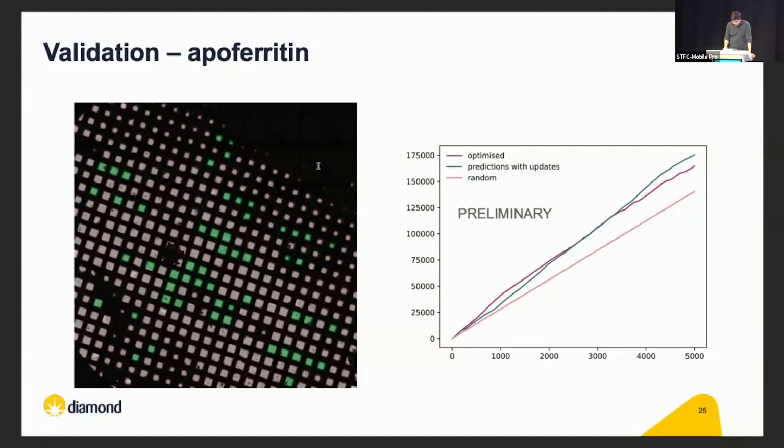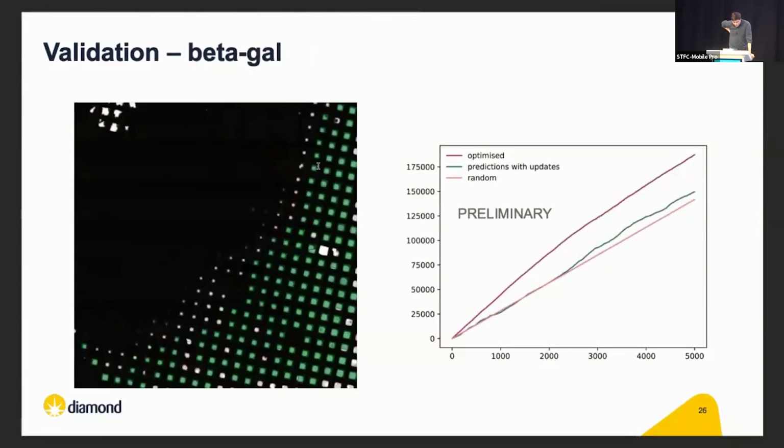And then I've got a data set that doesn't perform so well, which is actually the data set from before, where nothing correlated with anything. So you see here, it's doing badly. It's on the random line, and then it takes a little bit of an uptick as it learns something about the data set. But it's struggling to learn something here because none of the reported processing metrics are correlating very well with anything visible at low mag.